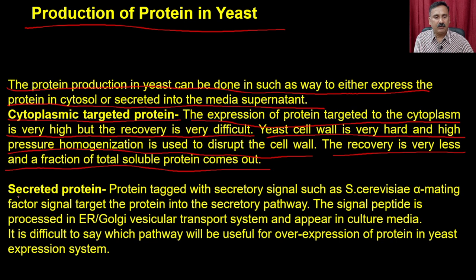Then you can have the secreted protein. A protein tagged with a secretory signal such as the alpha mating factor signal targets the protein into the secretory pathway.